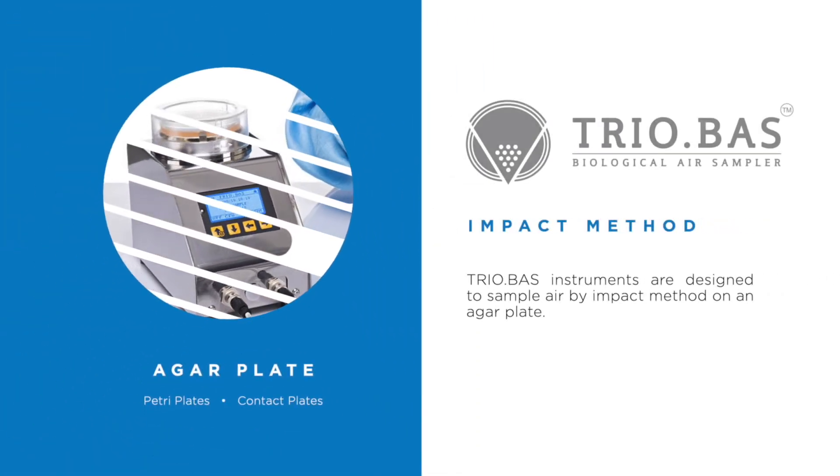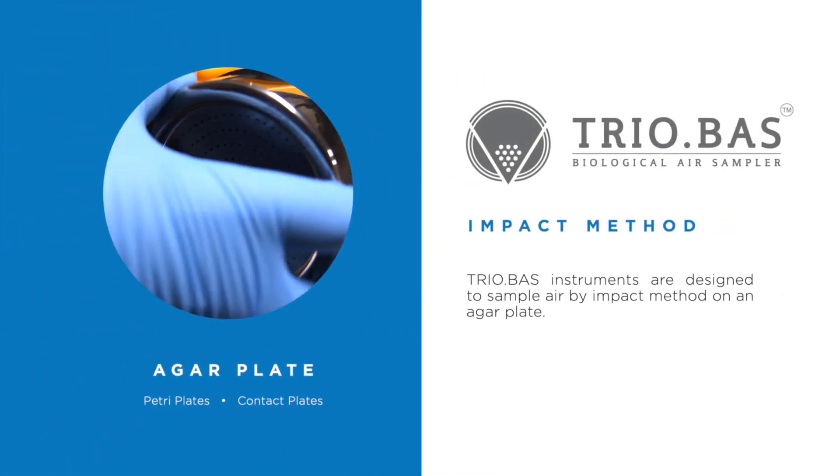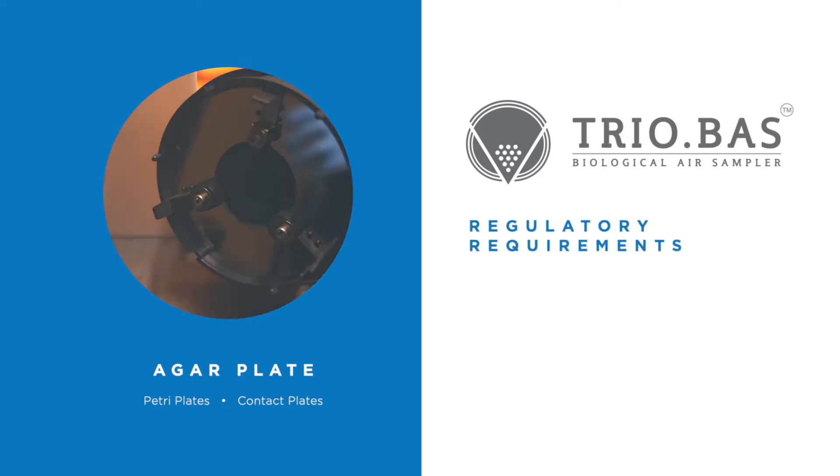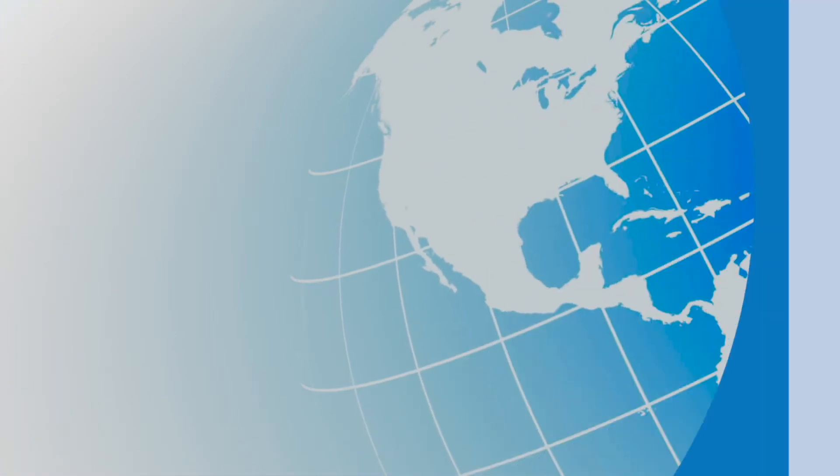Triobos instruments are designed to sample air by impact method on an auger plate. They meet regulatory requirements for air evaluation to ensure a controlled environment.